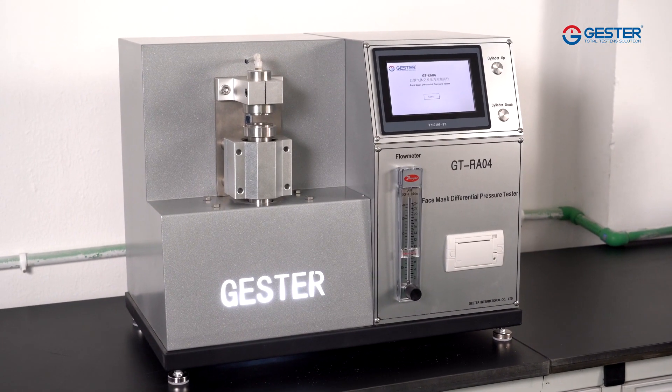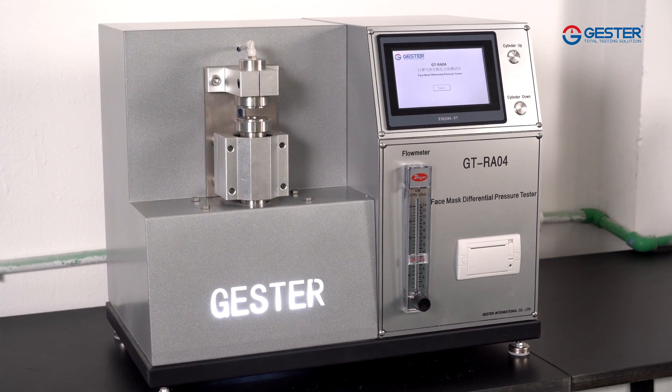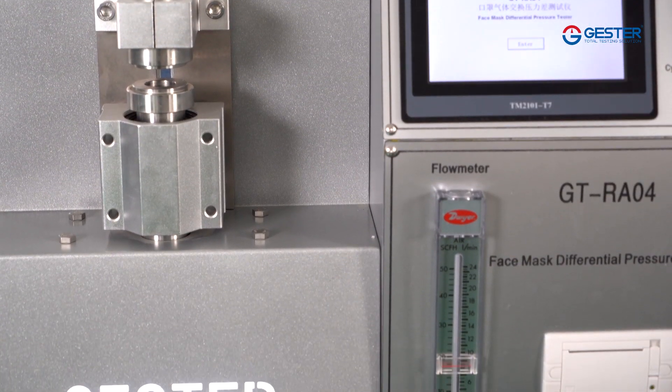The Face Mask Differential Pressure Tester is used to measure the air exchange pressure of masks and other fabric.